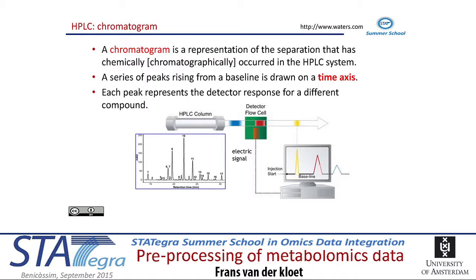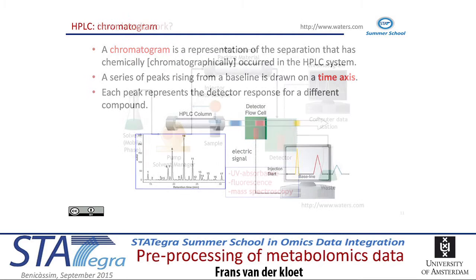And this is really important: a detector response for a different compound. And in the end, in time, I get a nice peak like this.